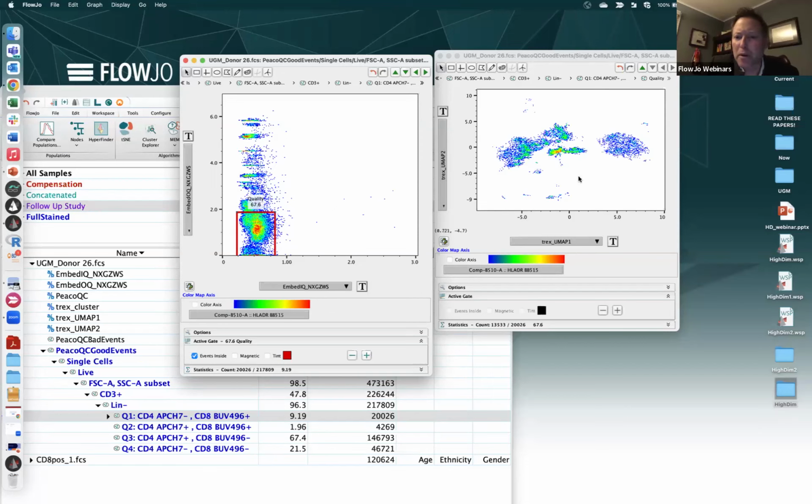As you go farther, you probably get more cells lumped into that. Like, I'm not sure where to put a group and so forth. And then these populations thicken up as well. We went all the way to like the lowest quality ones. Okay, well actually those are probably okay. They're probably just slightly distant from those two populations that were of interest. And then here's one that's maybe out in the middle of nowhere. Anyway, so that's how you could use the input quality score however you'd like to filter down embedding results, the ones that fit best or maybe are the most novel and perhaps the most interesting.